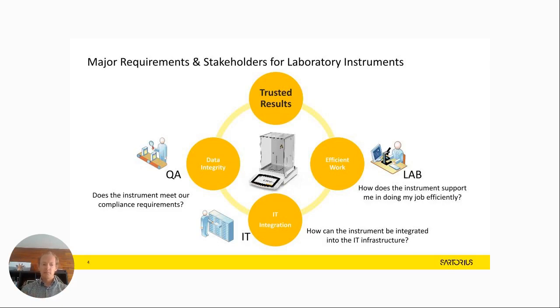In the past, a lot of people bought a lab instrument, or in this specific case a balance, and they just had to know what they were doing. But in modern times, it got more complicated. Often we can't decide that alone. We need the QA regulations: which regulations do we have to work under? And often the IT: how do we integrate an instrument into our network, into our LIMS system, our internal network, and so on? So it's not just us. A few more stakeholders come into that decision.